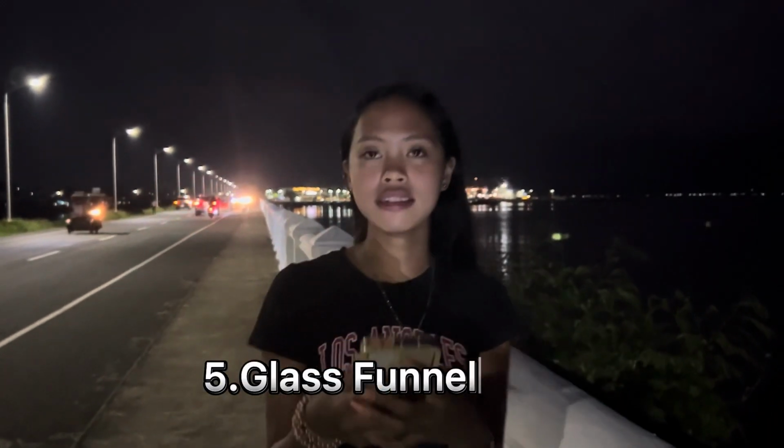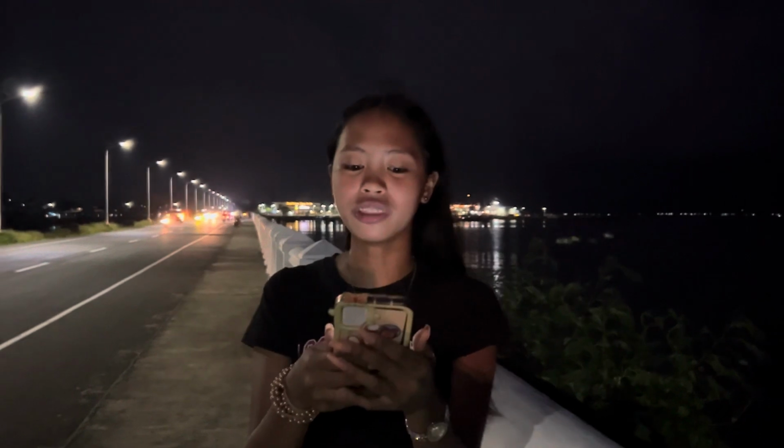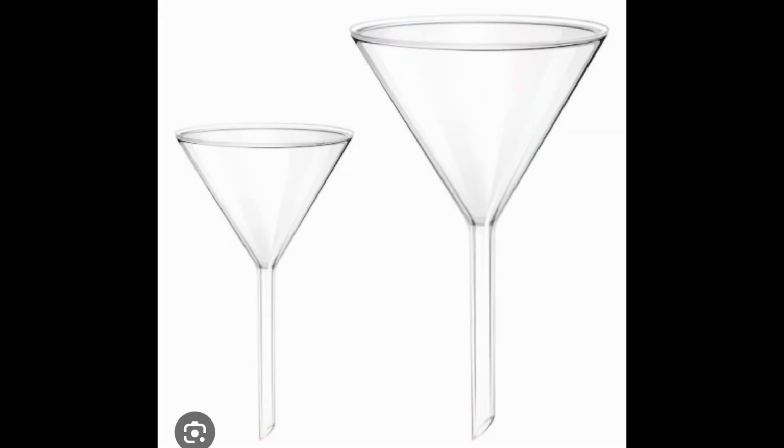Fifth, glass funnel. Glass funnels are for funneling liquids from one container to another, or for filtering when equipped with filter paper, to channel liquid or fine-grained substances into containers with a small opening, used for pouring liquids or powder through a small opening, and for holding the filter paper in filtration, used in transferring liquids into small containers.